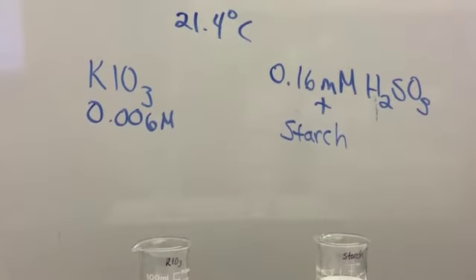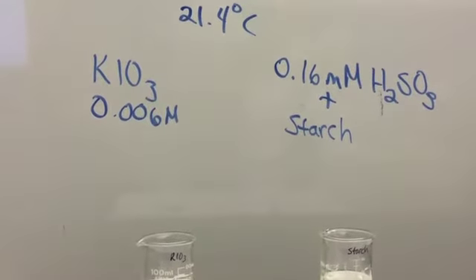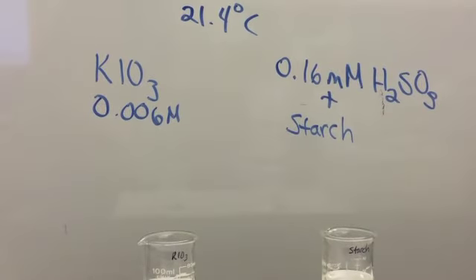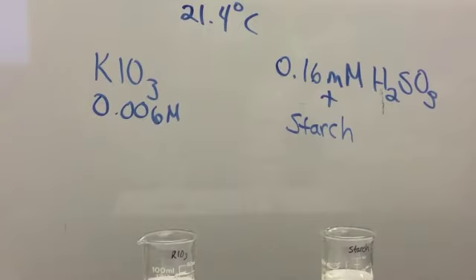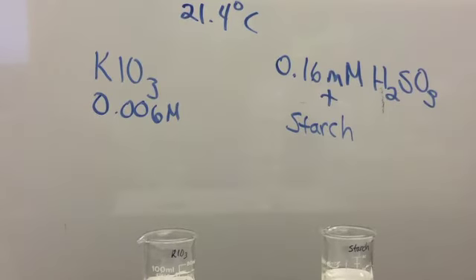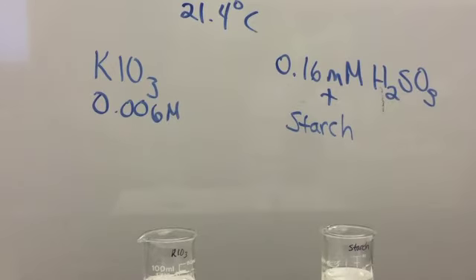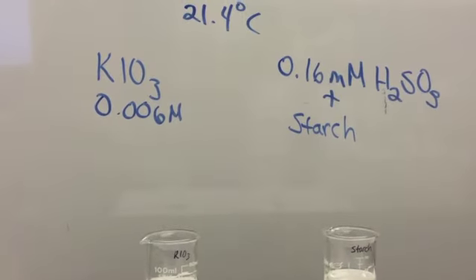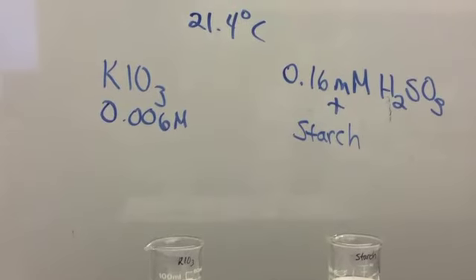This is going to be our baseline reaction. We're going to look at this reaction under different conditions, including different temperatures and different concentrations. We're starting with a 0.006 molar potassium iodate solution and a 0.16 millimolar sulfurous acid solution in starch. The millimolar means that this is actually 0.00016 molar sulfurous acid. The temperature is 21.4 degrees Celsius.